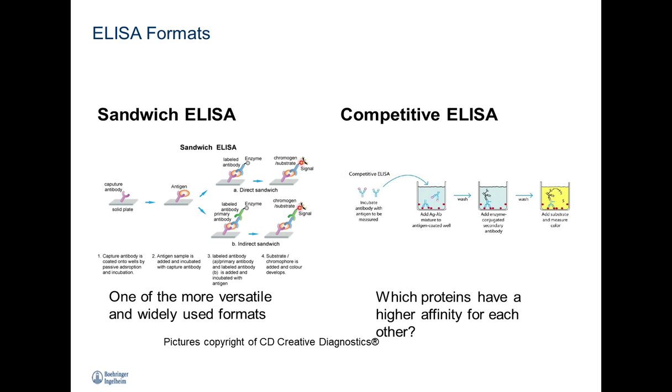Known antigen would be used to coat a multi-well plate. Following standard blocking and washing steps, samples containing an unknown antigen are then added. Labeled detection antibody is then applied for detection using relevant substrates such as TMB or ABTS. If there is a high concentration of antigen in the sample, a significant reduction in signal output will be observed. In contrast, if there is very little antigen in the sample, there will be a small reduction in the signal output.